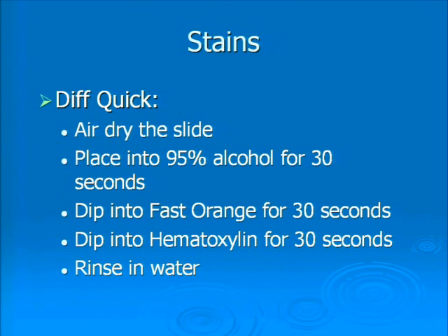The last container you're going to see on the table is just going to be water. That only takes 4 or 5 dips just to rinse off the extra stain. You will have taken that glass slide and put your initial on the front of it. Make sure that initial is facing you. Pick up a piece of gauze and wipe off the extra water off the back, otherwise it sticks to the microscope. Now I'm going to tell you this one more time. Make sure your initial is facing you and you wipe the back off, because someone's going to wipe their sample off the slide, okay? It happens all the time.